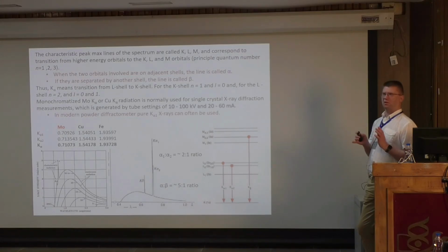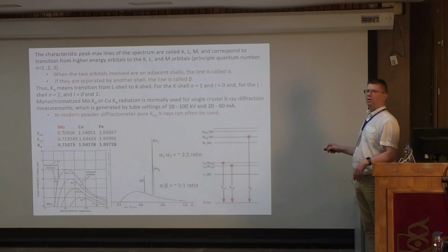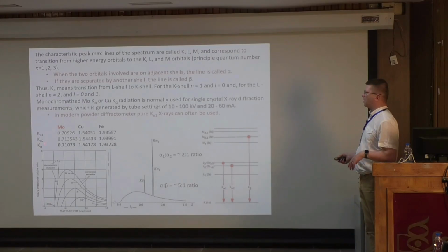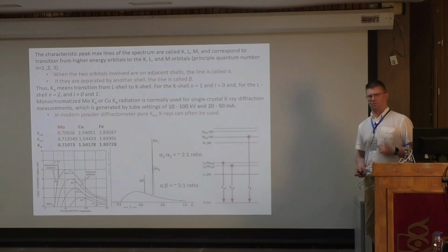So we have to do this thing. We have to select, are we using the molybdenum wavelength, or are we using copper, which are the normal ones. So molybdenum and copper are the things we use. We cannot use both of them simultaneously. We can repeat the same experiment with copper radiation and with molybdenum radiation, and the result will be the same. The only thing is that the interaction of these wavelength radiations with our crystal might be slightly different.